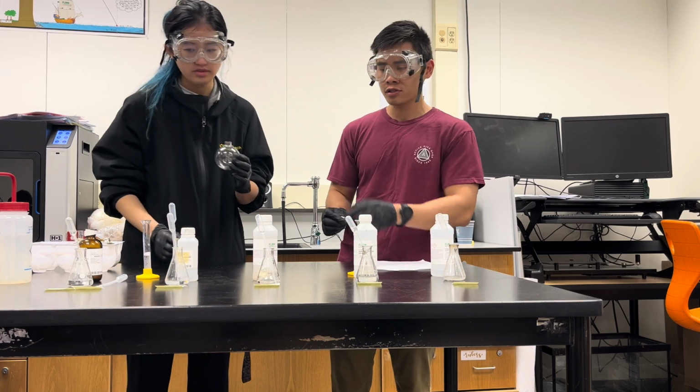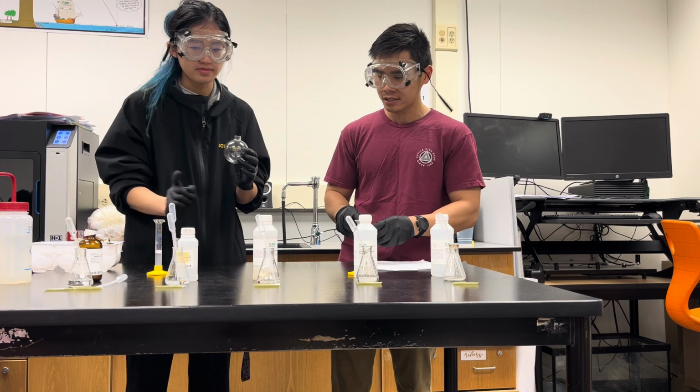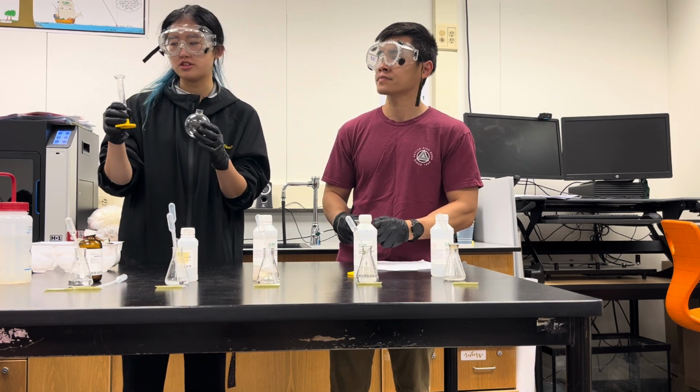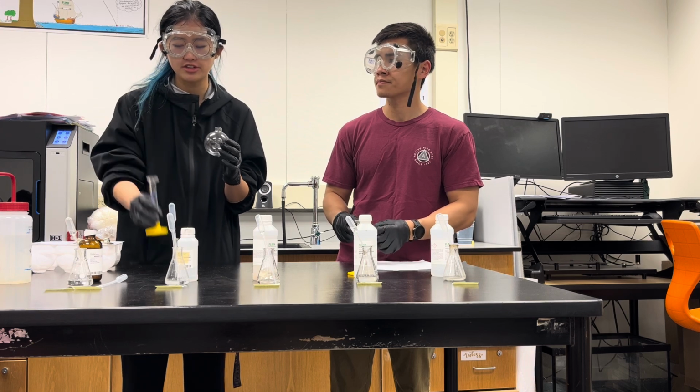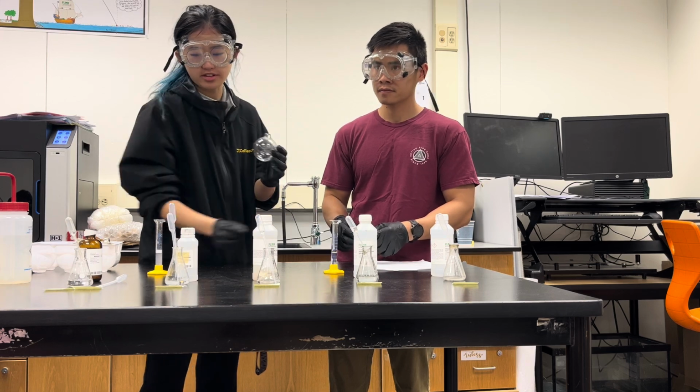After the dextrose, we have the mixture of silver nitrate and ammonia nitrate. And then this next step has to happen pretty fast. So you're gonna do, like Mr. Liu said, the silver nitrate ammonium nitrate mixture, and right after you add that, you'll add the sodium hydroxide. So I'm gonna do that right now.